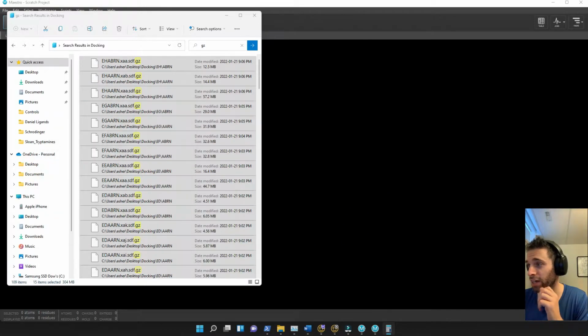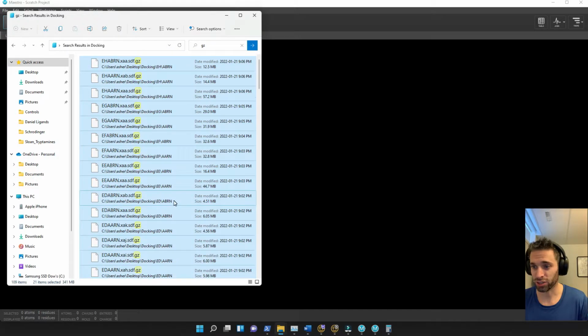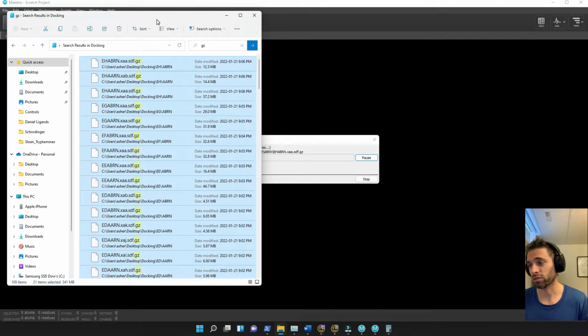Divide by 5, we get 21.8 approximately. That's a decent way of doing it. So if we select 15, 16, 17, 18, 19, 20, 21, let's see how many 21 gives us. Click, and that'll drag all my files into the workspace.